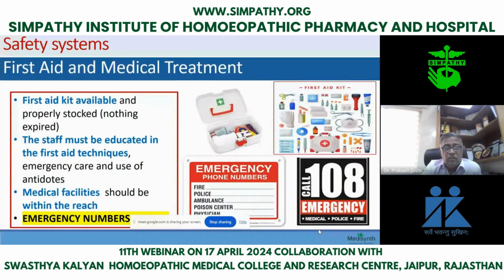Now the first aid kit is very important. It should not be that it was purchased in 1970 and is still working until 2024. The first aid kit has all the medicines, and you can see Savlon, it has a shelf life. So it should be regularly checked. And if it is expired, you should replace it. Sometimes I have seen that the Band-Aid is there, but there is no glue on the Band-Aid. So it is very important to understand all these things.